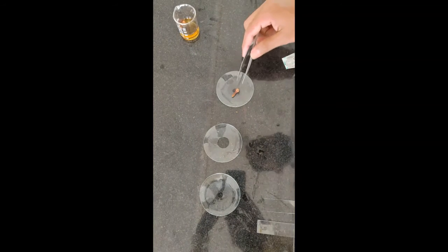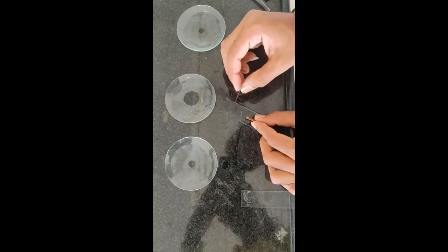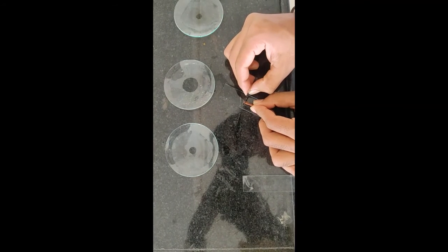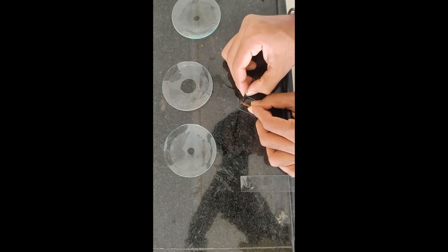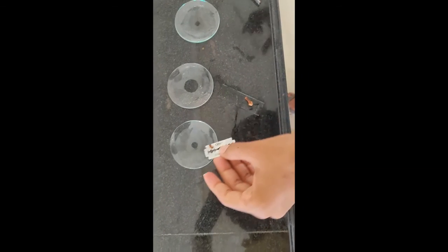Now transfer the clove bud to the watch glass containing water. Then remove the end tip of the clove bud and take the thin transverse section, and transfer it to the watch glass containing water.